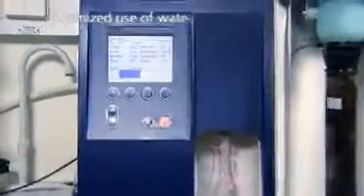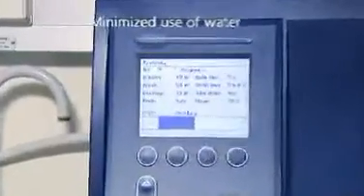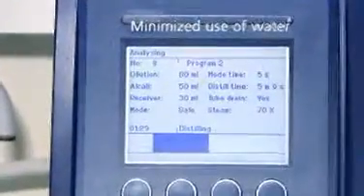The self-adjusting cooling water system measuring the steam and distillate temperature minimizes water consumption.